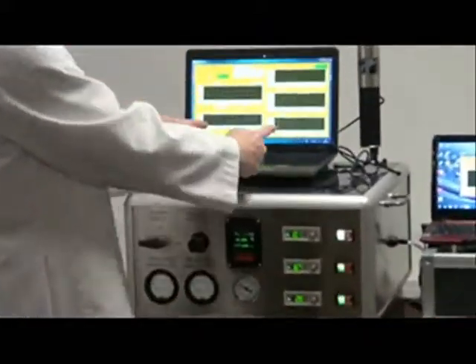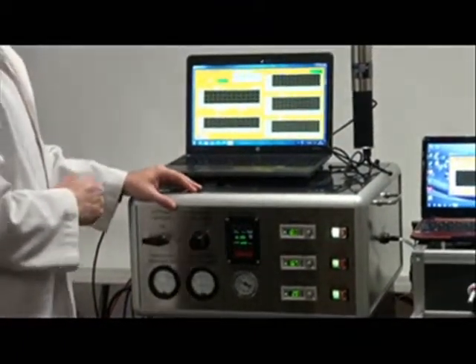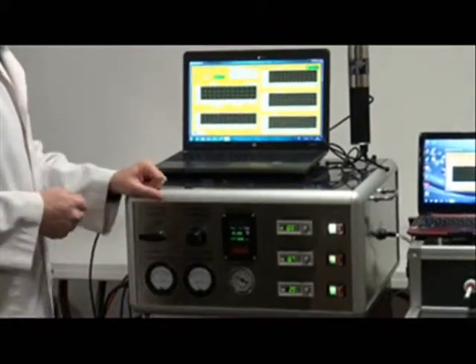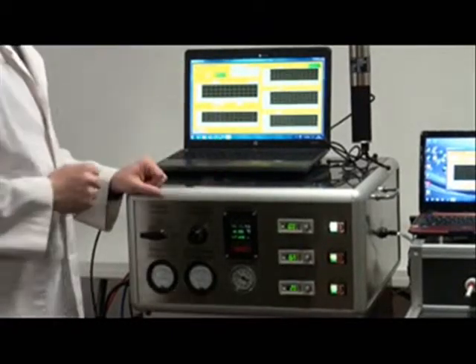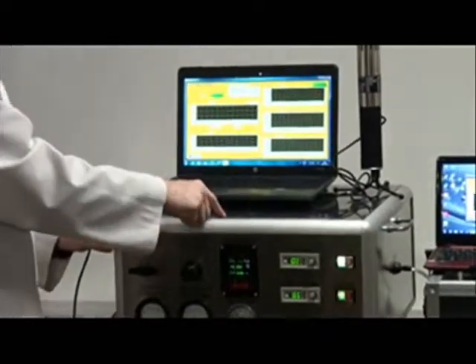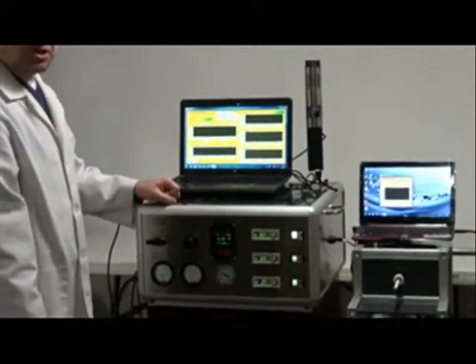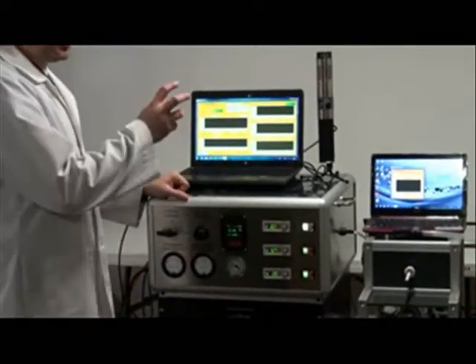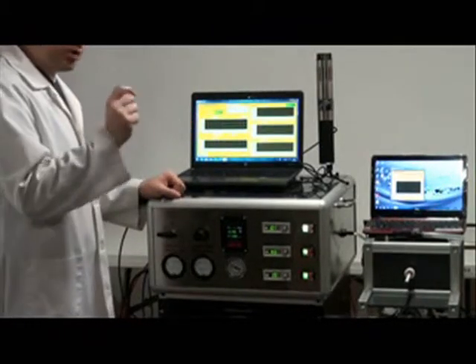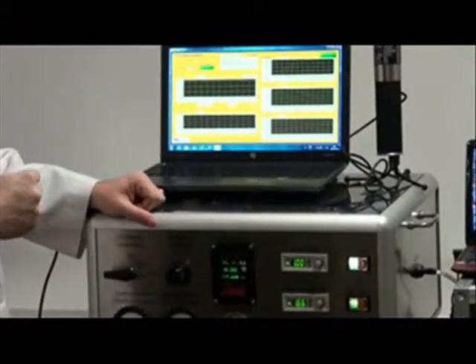After that, in between the two mixing jars, there is a vacuum mass flow controller. When we set the concentration that we want the siphon to generate, the aerosol monitor that is inside the box measures the concentration at the outlet of the siphon and sends the signal back to the control unit, which then compares that to the set concentration and commands the mass flow controller to siphon off part of the pre-diluted mainstream smoke in order to bring down the concentration to the set concentration.